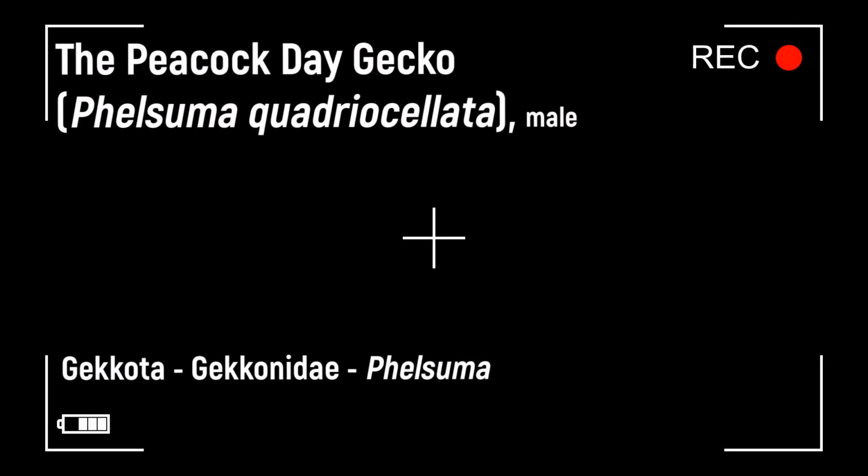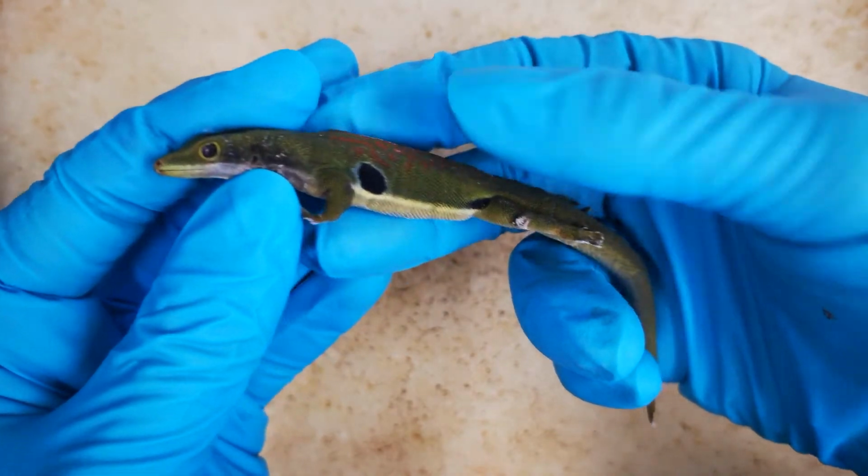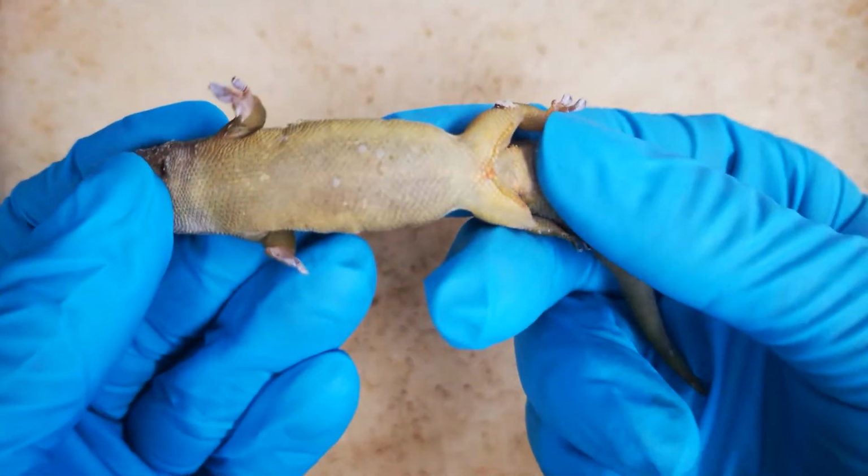Returning to Phelsuma, we will now look at a specimen of another species, Phelsuma quadriocellata, the peacock day gecko. This species is much smaller than Phelsuma standingi. This is an adult male. Notice the differences in coloration.